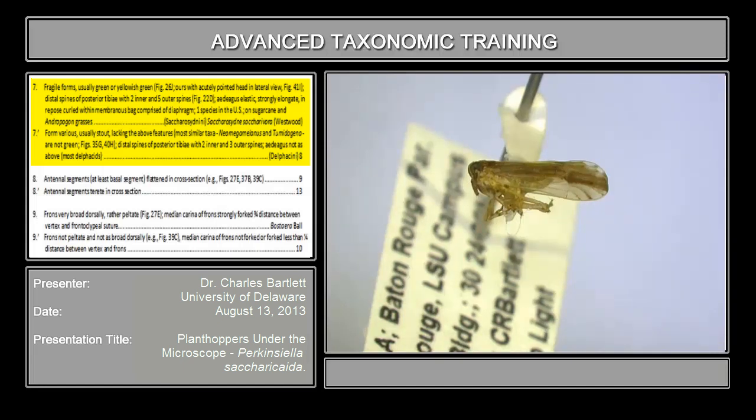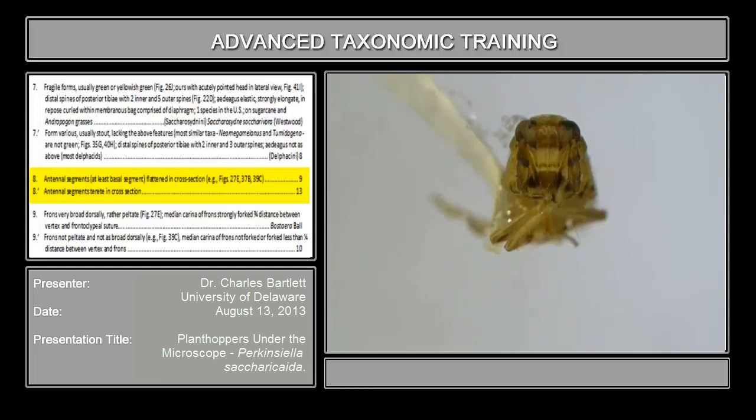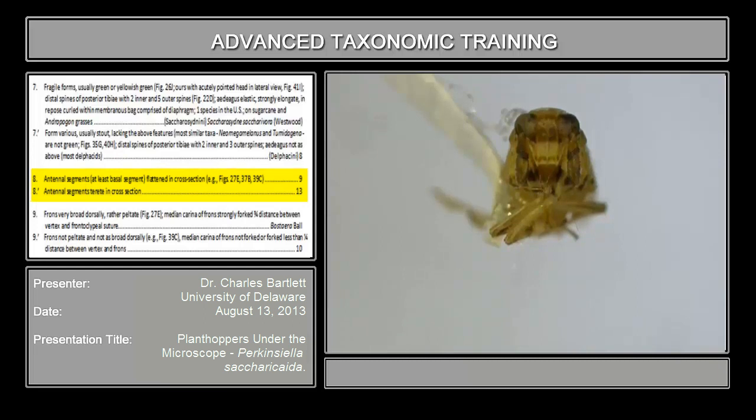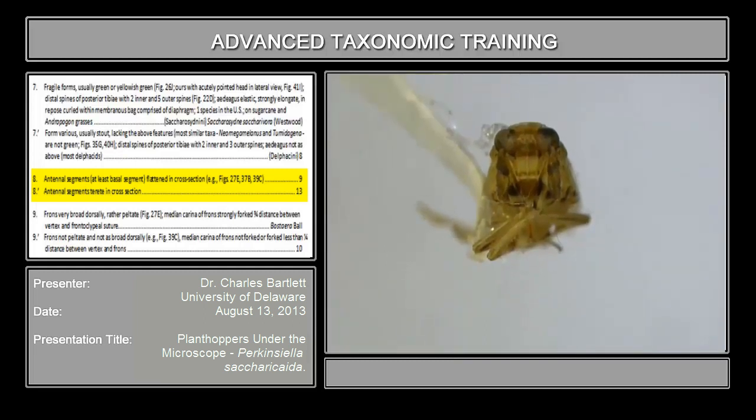Good, we've got couplet eight. The easiest way to evaluate couplet eight is to look at it from frontal view. So I'm going to turn this to look at it in frontal view so we can see the antennae and the face. Couplet eight reads: antennal segments, at least basal — the first segment — flattened in cross-section, or antennal segments terete, which means rounded in cross-section. Looking at the antennae, you will discover fairly quickly that these antennal segments are flattened, particularly on the right-hand side. So antennal segments flattened — we're going on to couplet nine.